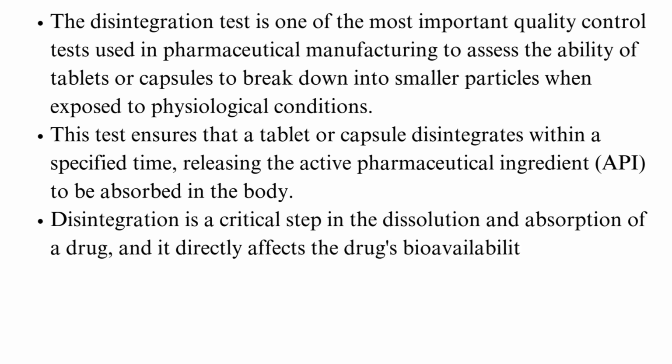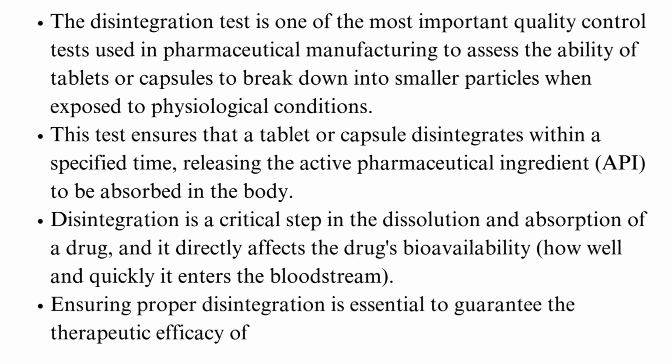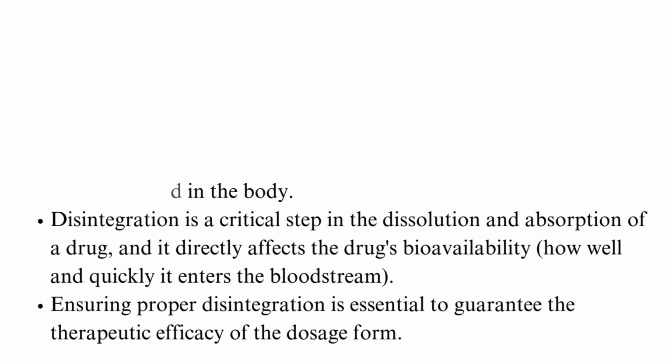affects the drug's bioavailability, how well and quickly it enters the bloodstream. Ensuring proper disintegration is essential to guarantee the therapeutic efficacy of the dosage form. Principle of the disintegration test.